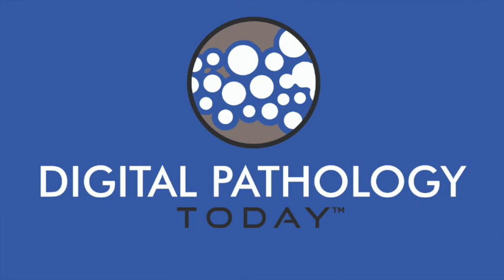I can tell you that even on the regulatory side, we are pursuing very much an FDA IVD pathway, with both the hardware as well as the software going through clinical trials at this moment in time and getting approval for FDA IVD. And that is one of the routes that we are pursuing. So yes, there's a business case. Start off with the clinical trials, get it validated, having the pharmas and the biotechs involved in developing their drugs using our tool, and then moving towards the clinical diagnostics.